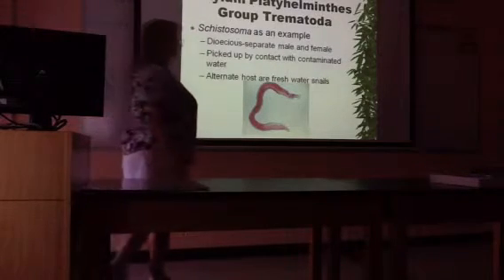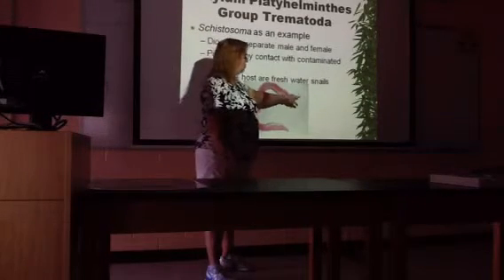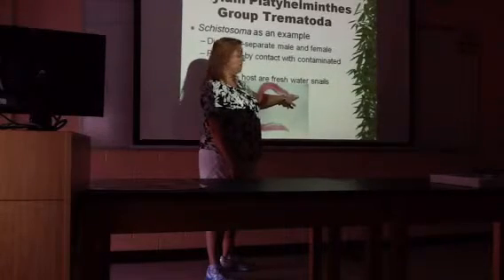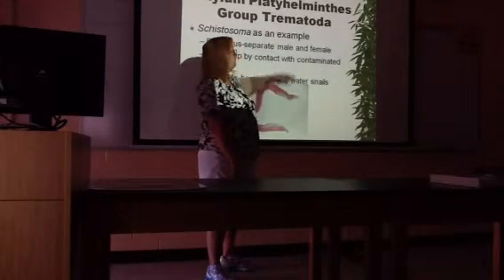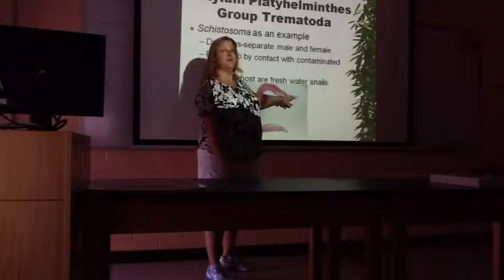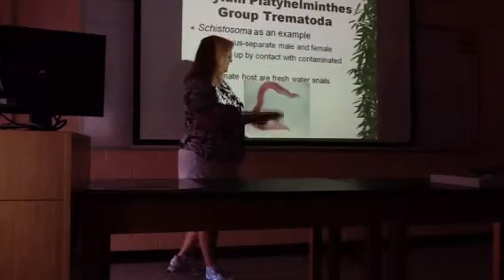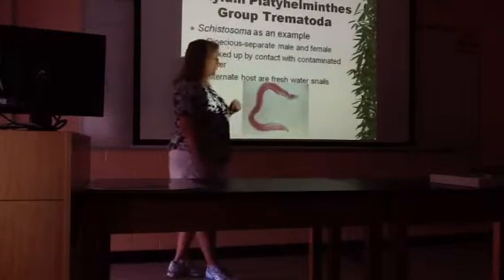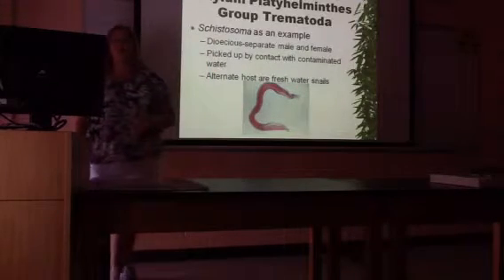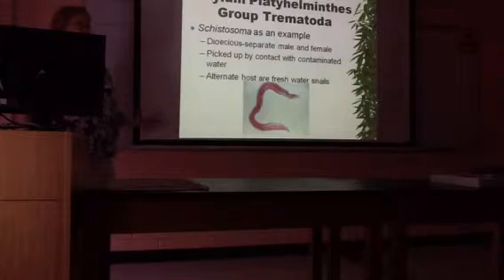And this is a picture of one, just so you can see it. The mouth parts, just to warn you, look round, right? So if you were to see this slide and you see that, you might say, oh, that's a roundworm. But it's Platyhelminthes. Don't look at the mouth. The mouth on all of them are round. Look at the tail end. That will tell you if it's flattened. You can tell that that's a flat worm and it's not round the whole way. And so don't focus on the mouths when you're trying to figure out which group it's in. All the mouths are round.